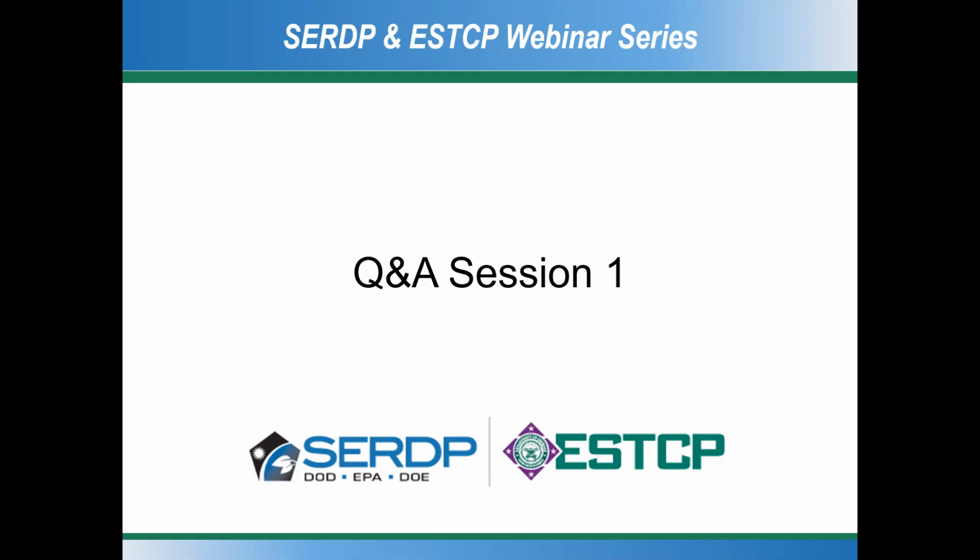This is a question from the U.S. Army Corps of Engineers. Can groundwater samples collected using passive diffusion samplers be used for CSIA? I don't see why not.